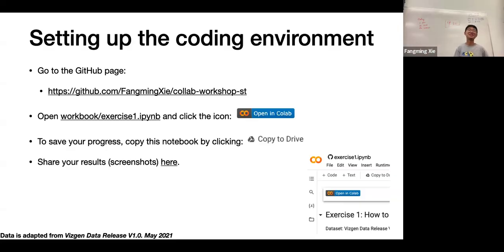So I guess there may be ways if you provide them with a mouse atlas and you want them to register the sections onto a general framework, then you know which slide is where, but there will be a lot of back and forth when you do those kinds of things.